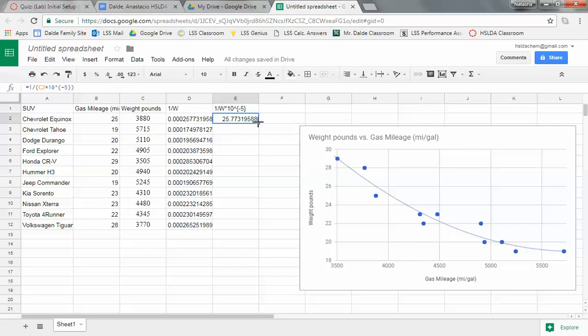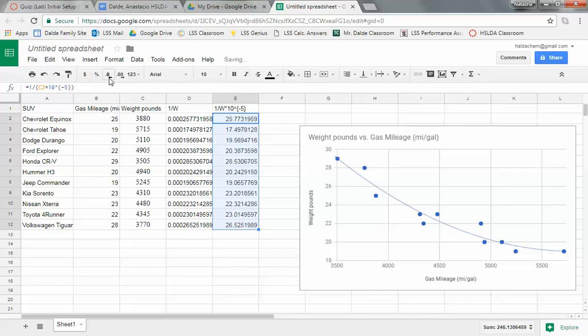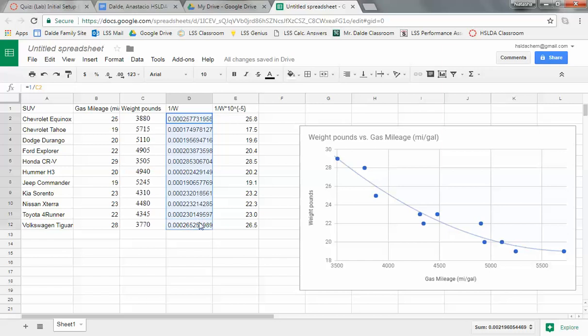And then I'll scroll down. Now, honestly, there's too many numbers. There's too many significant figures. And I don't think that we've explained significant figures at this point yet, but you'll learn about those. For now, I'm just going to limit this to say it has like that many correct numbers. I don't need to report every single one of those numbers because I don't think it's that accurate.